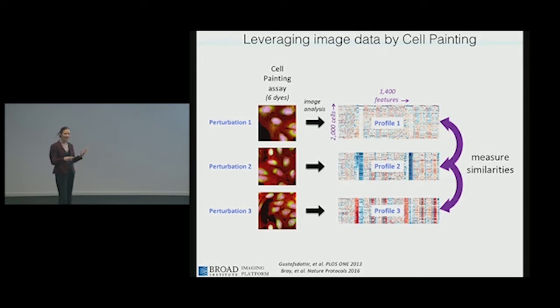So the whole rest of my talk comes down to the intuition of a microscopist, which is my background. Can we look at a cell population that's quite heterogeneous, and can we say this cell population looks like that one, and this one doesn't look like that one, and these cluster together and those don't? That's fundamentally the process that we're taking here, which you can do by eye to some extent, but you certainly don't want to do it at this scale. And secondly, the human visual system can only see certain things in images. And so we're trying to maximize the capabilities of the computer and leverage them as much as possible. So all the projects I'm going to describe involve this basic concept.